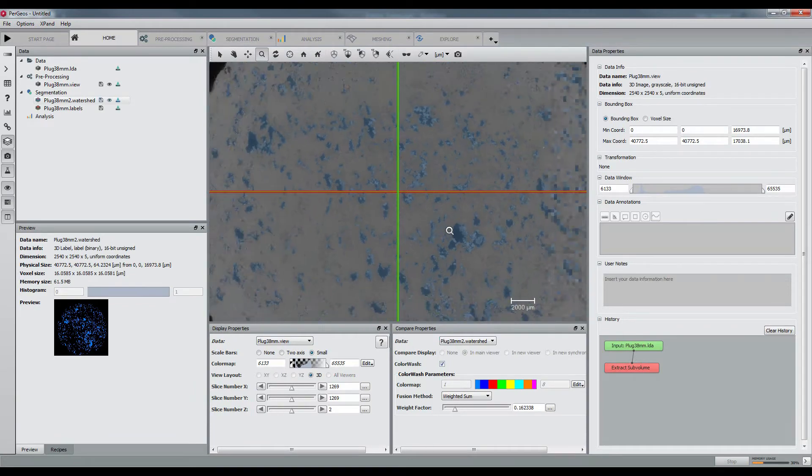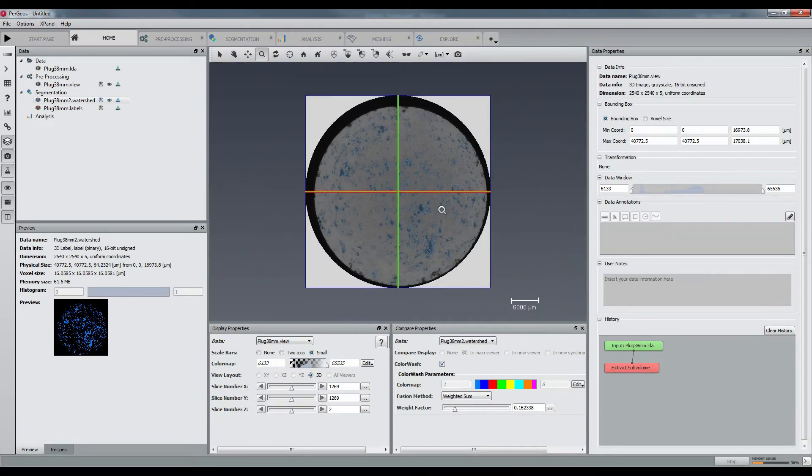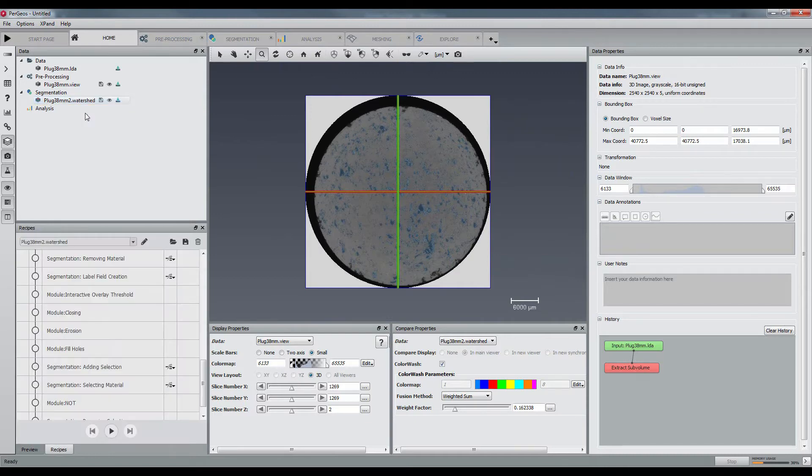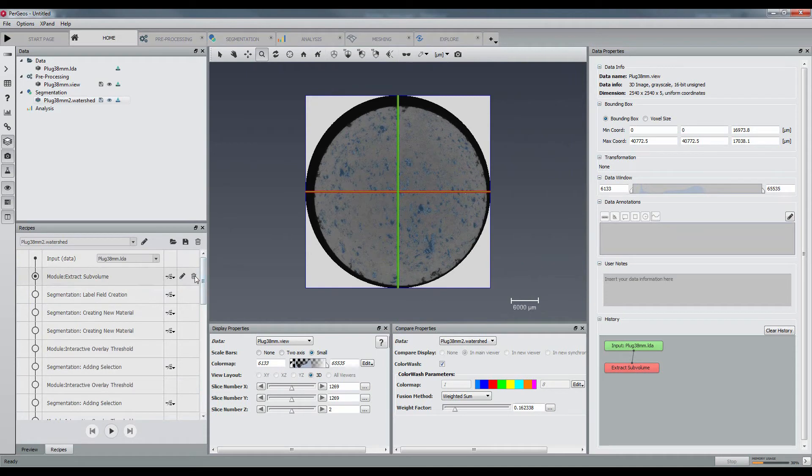We can now save a new recipe in order to keep trace of all parameters. The extract sub-volume step needs to be removed.